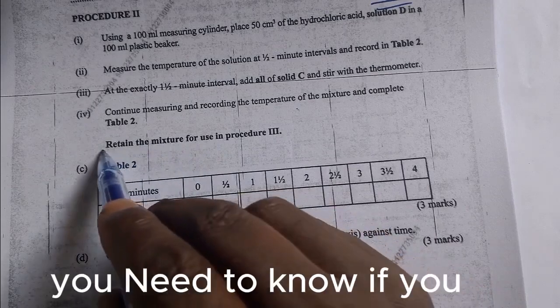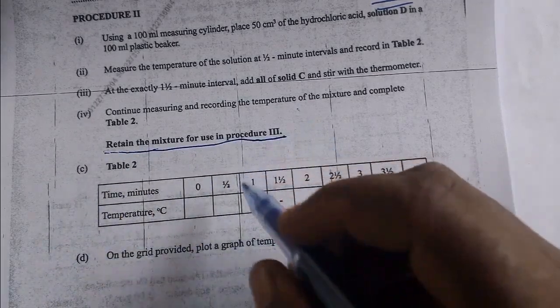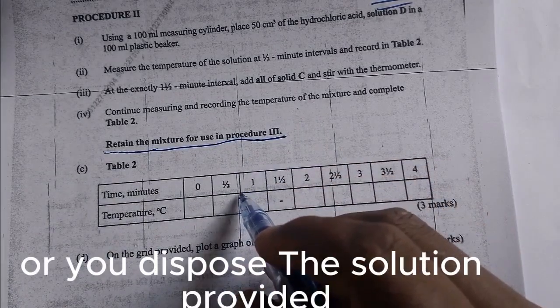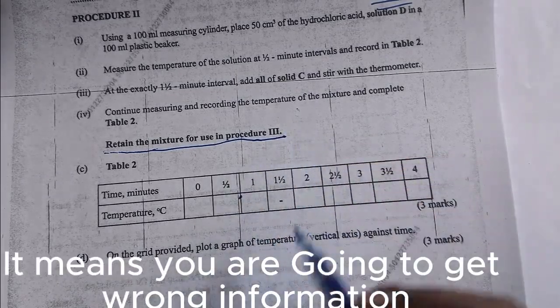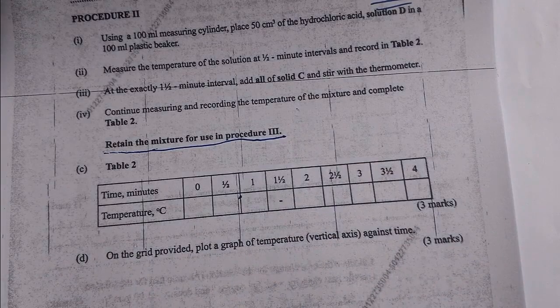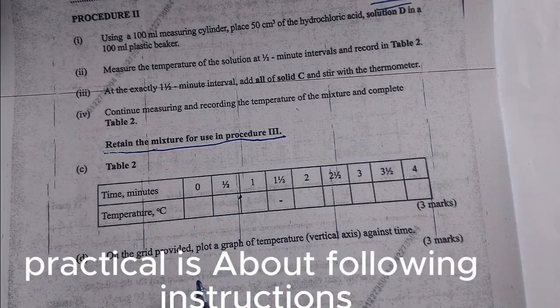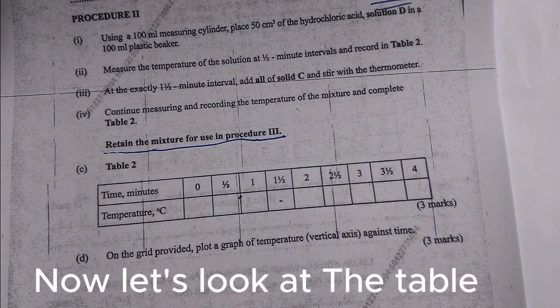This is very important. You need to know that if you accidentally pour down or dispose of the solution provided, and you were supposed to use it in procedure 3, then it means you are going to get wrong information. Therefore, follow instructions. Practical is about following instructions. Now let's look at the table.